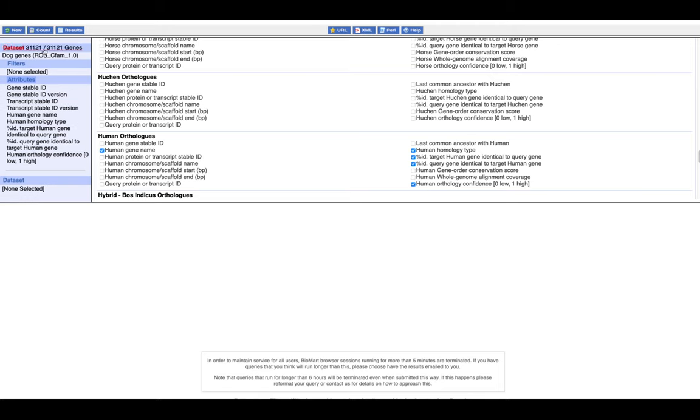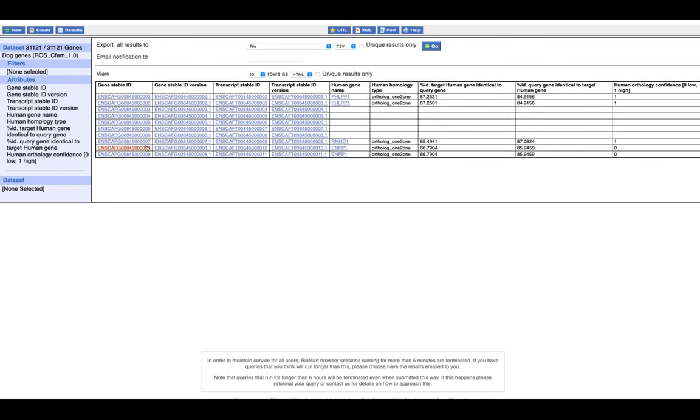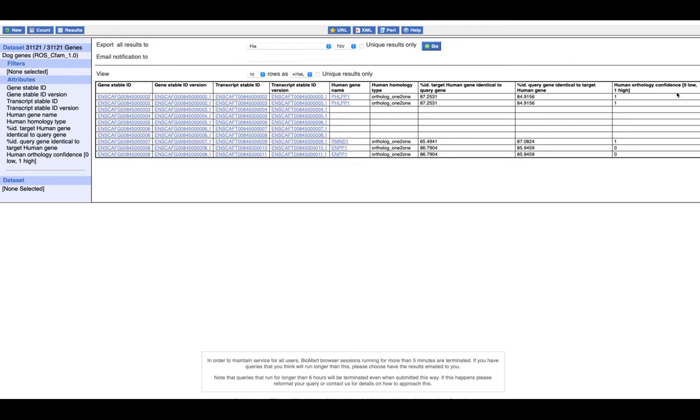The results look like this. You have gene ID and then you have transcript ID according to different species, and then the name of the gene in human. The orthology type, which is homology type, which is one-to-one in this example. Then you have the identity, percentage of identity of the target and the query, and the confidence. So zero is low, one is high. You can then either download it as Excel file, TSV file, or CSV, and then you will get this 31,000 query into any other tool that you want for further analysis.